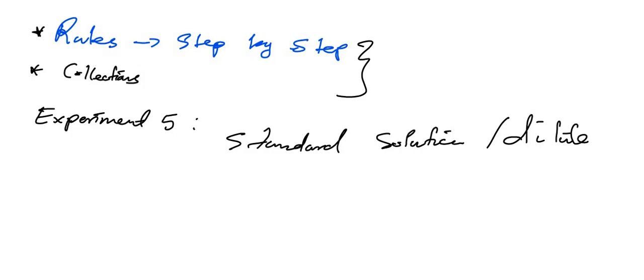So I'll go straight to the end of your procedure, like after you follow your experiment, because here they've given us, I'm using this example, you have sodium hydroxide. They will tell you how much of this you are getting from the lab technician, because these are in small proportions that side. So you get, let's say, 0.5 molarity. That's their concentration.